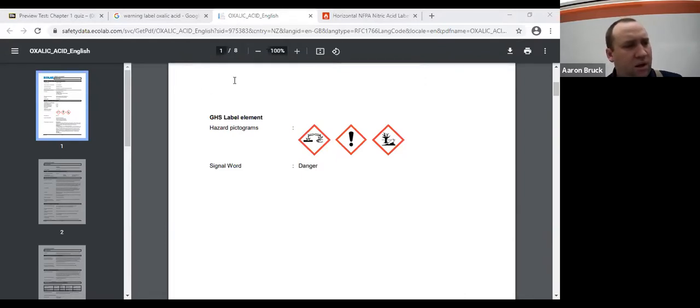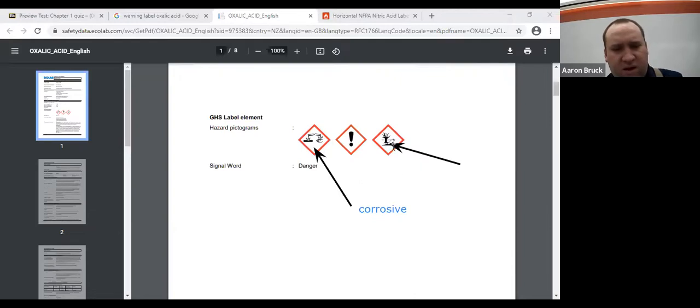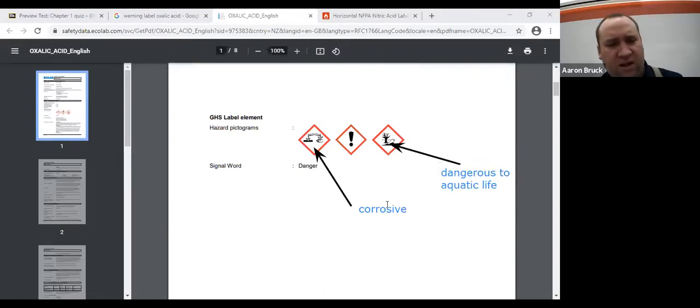So let's start breaking this down piece by piece. So right here, the first part indicates that we have something that is corrosive. So those of you that said that we are dealing with a corrosive material, you're absolutely correct. Kiara pointed out that we have the aquatic pictogram, which means that it is dangerous to aquatic life. So that's a good one there.